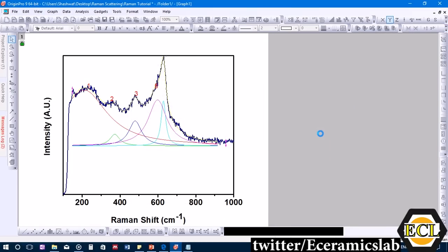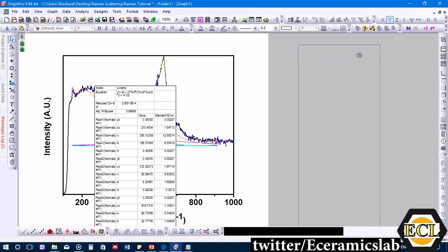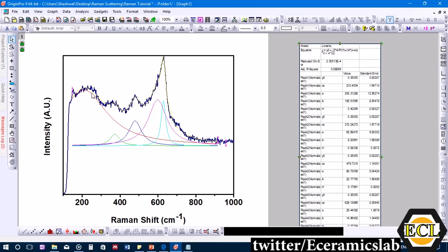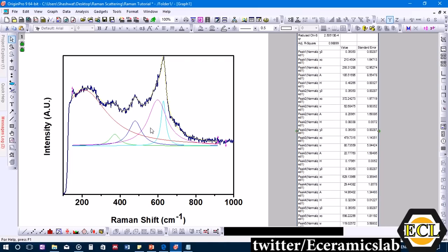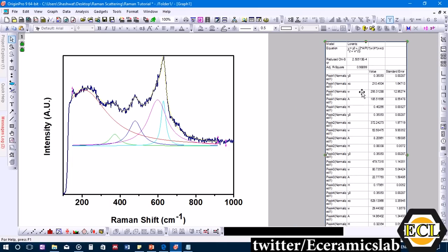Looking at the new results, the first peak (red line) is around 210 per centimeter with an area of 185. The second peak is around 372. Another peak is around 479, then one around 598 and one around 629. These are the peaks identified from the Raman scattering data after curve fitting and deconvolution.